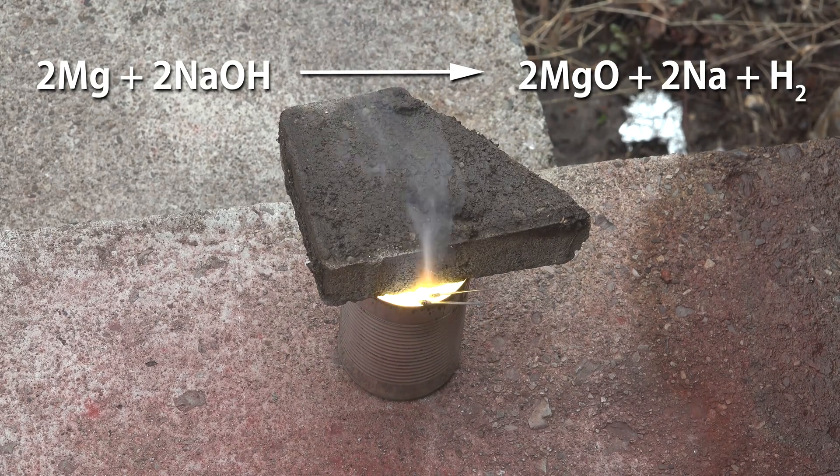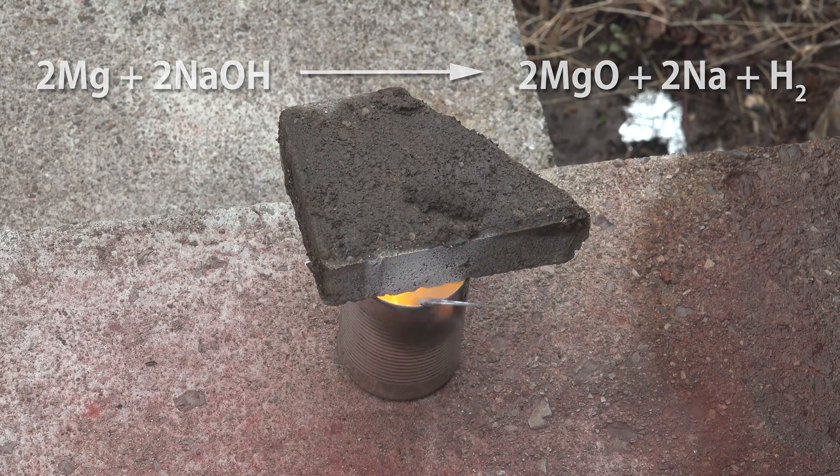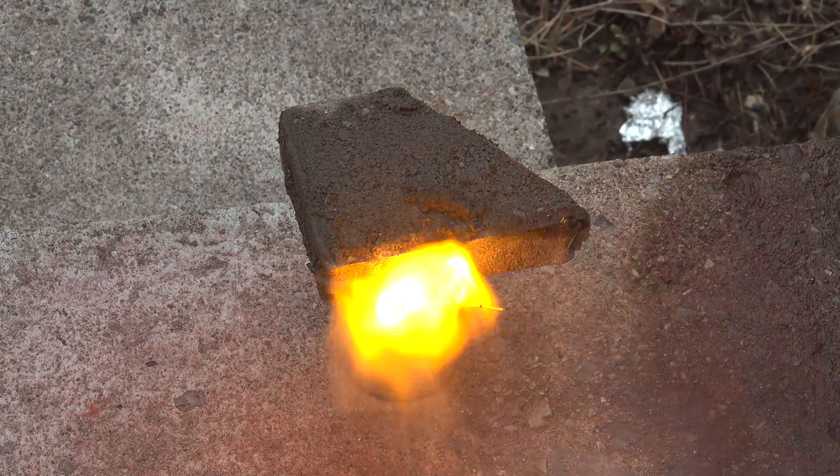produce magnesium oxide, sodium metal, and hydrogen gas. The hydrogen ignites and is the source for the massive flames you see here. This process makes sodium without electrolysis, so it's much more accessible to the amateur chemist. You need the heavy lid to reduce the exposure of air.